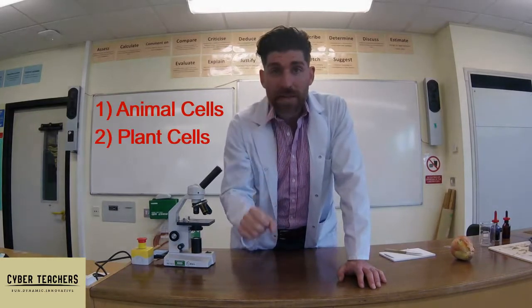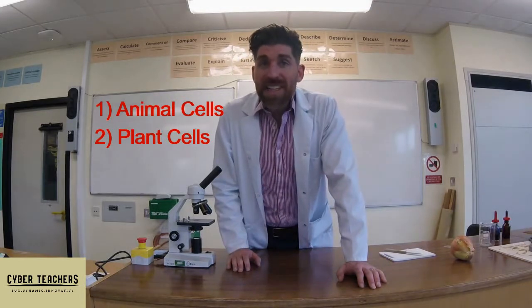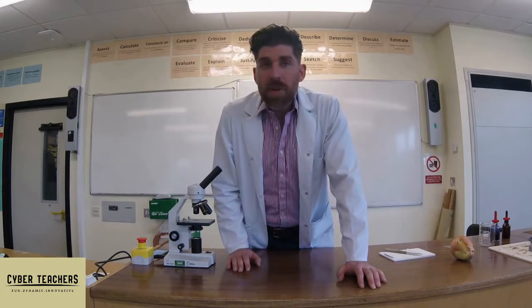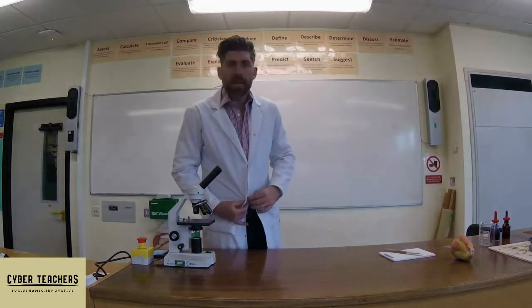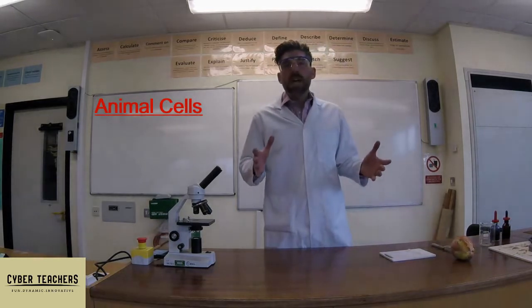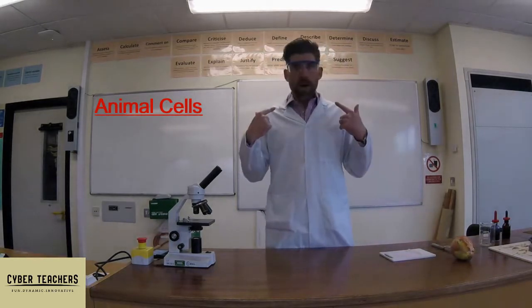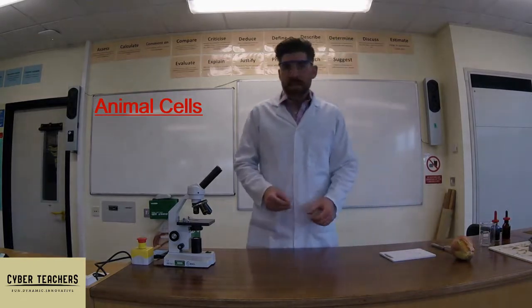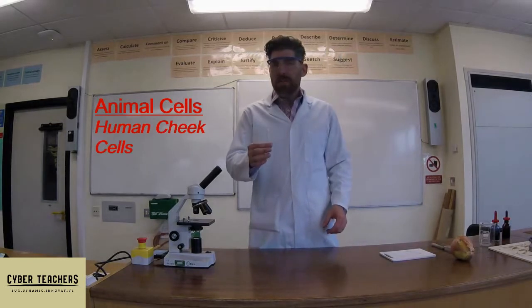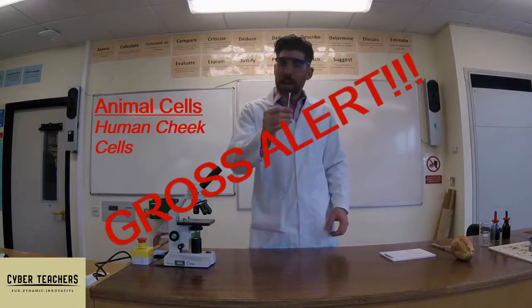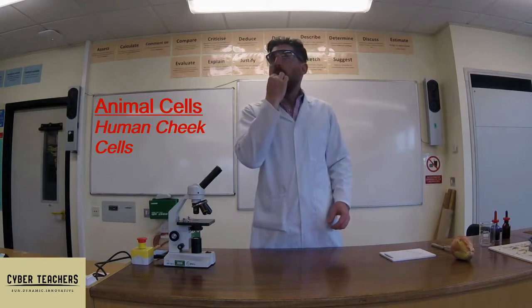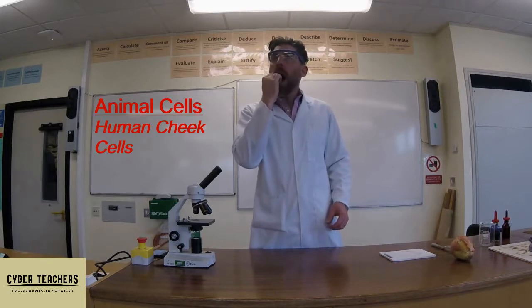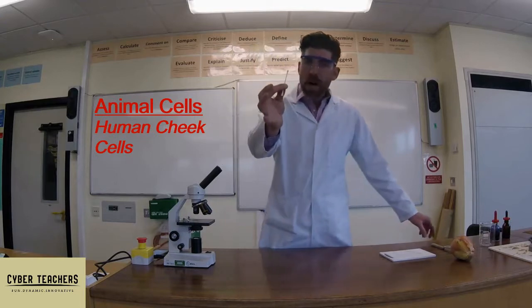For this required practical you need to look at two types of cells: animal cells and plant cells. You need to stain them, so your hands and clothes could get very messy — always wear a lab coat. For animal cells, the nearest and easiest source is cheek cells. So I'm going to get some cheek cells — a little bit of a gross alert — I'm going in deep and giving it a good rub around.